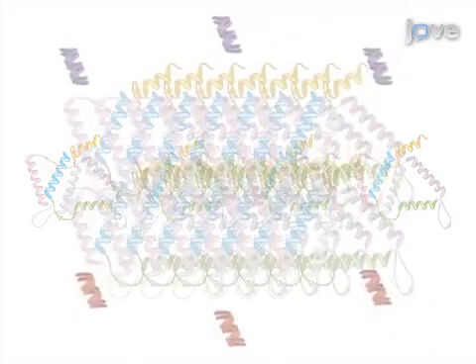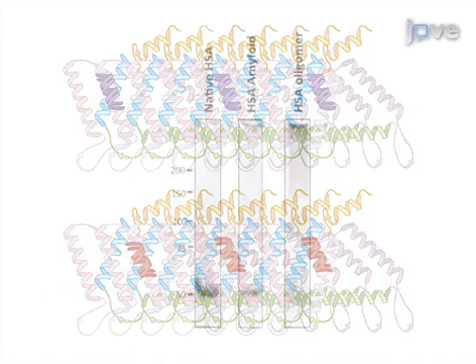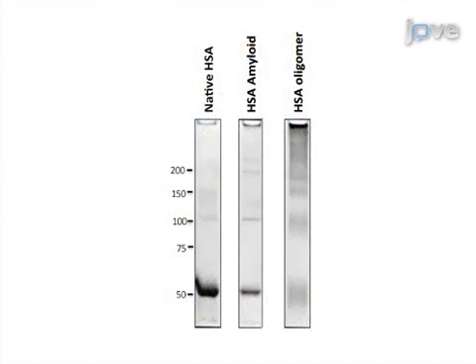Finally, non-protein cofactors are mixed with stabilized soluble protein oligomers to allow the formation of hybrid amyloid. Results are obtained that show native proteins can be readily converted into amyloid conformation when facilitated by favorable conditions. This method can help answer key questions in protein misfolding diseases, such as how precisely amyloid forms from soluble protein oligomers, and whether different types of amyloid have distinct biological and pathological functions.